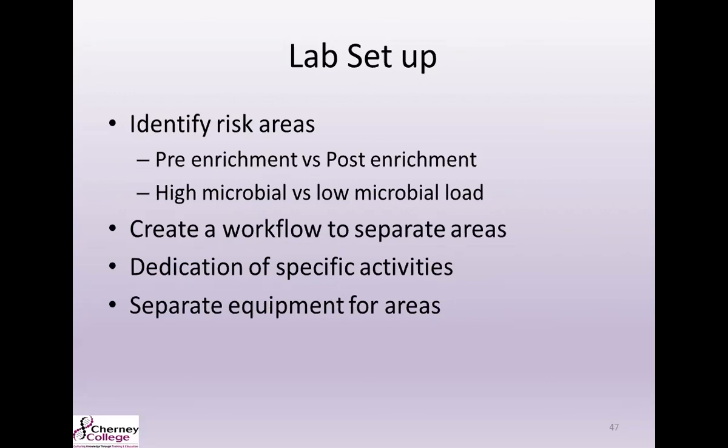You're going to want to create a workflow that makes sense throughout your lab. You don't want to do a lot of back and forth. So create a workflow that makes sense to each separate area. Dedicate it based on what specific activities you're going to be performing in that area. And make sure you have separate equipment for areas as needed.